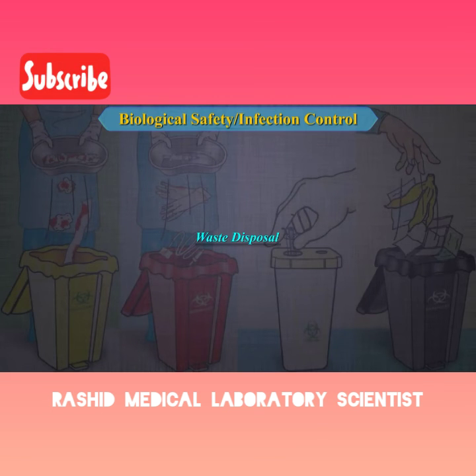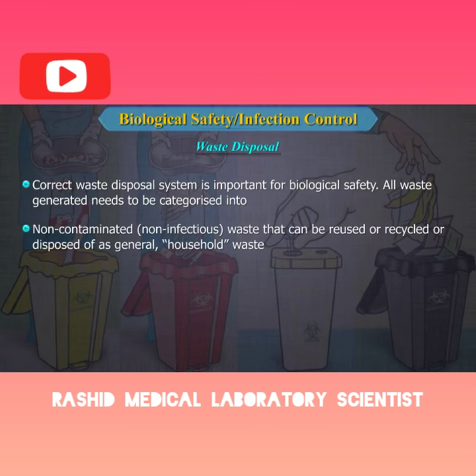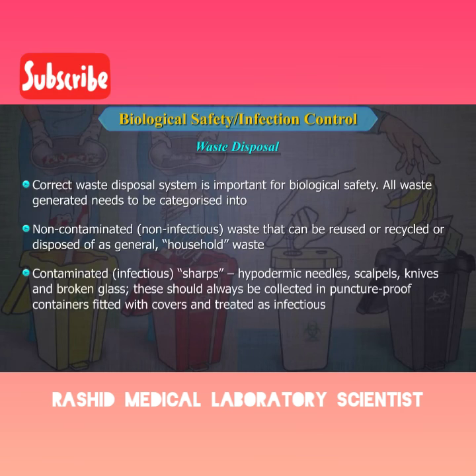Let us come to waste disposal, a very important item. Correct waste disposal system is important for biological safety. All waste generated needs to be categorized into: 1. Non-contaminated, that is non-infectious waste, that can be reused or recycled or disposed of as general household waste. And 2. Contaminated or infectious sharps: hypodermic needles, scalpels, knives, and broken glass. These should always be collected in puncture-proof containers fitted with covers and treated as infectious.